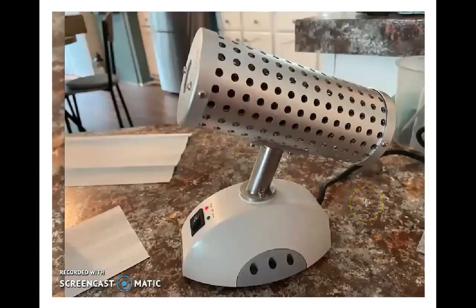Now, it's really important that when you're using an incinerator in a microbiology lab, you go ahead right at the start of your day and plug that thing in. These do take a few minutes to warm up, and they have to be red hot in order to work correctly. So I always plug the incinerator in right away when I get into the lab and I'm ready to start making slides.